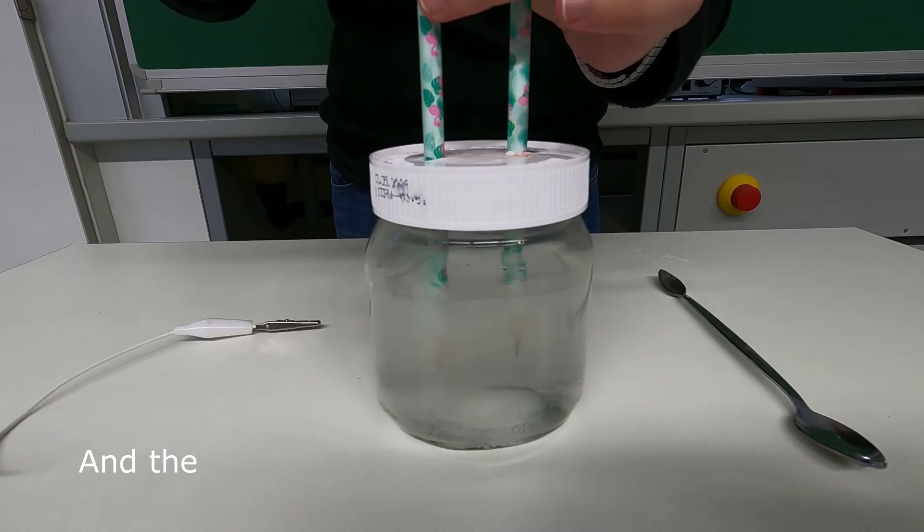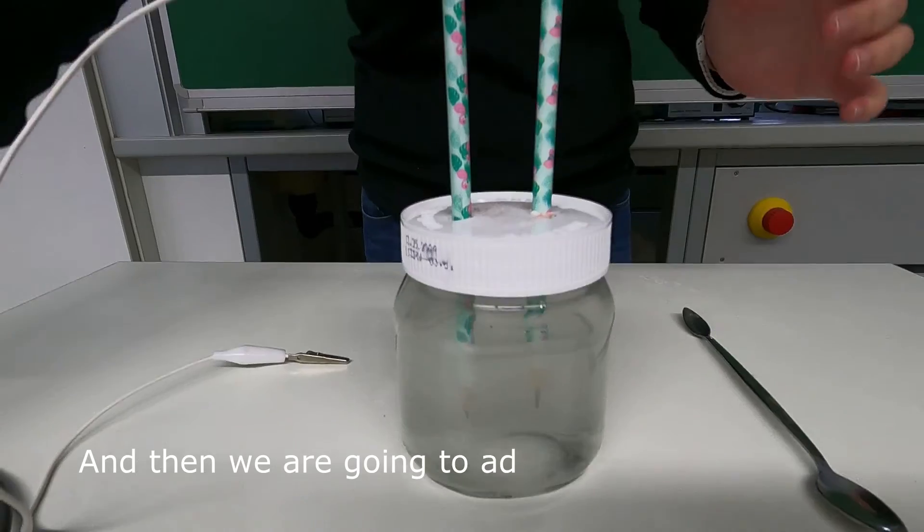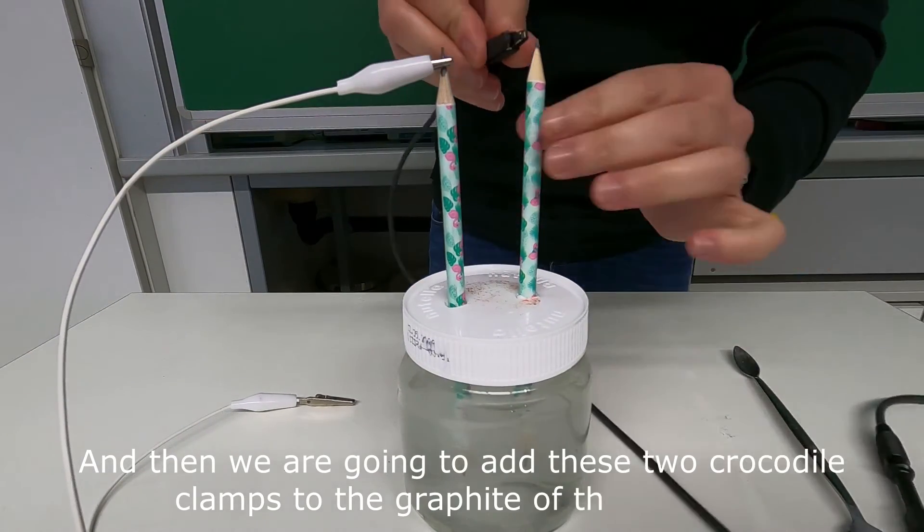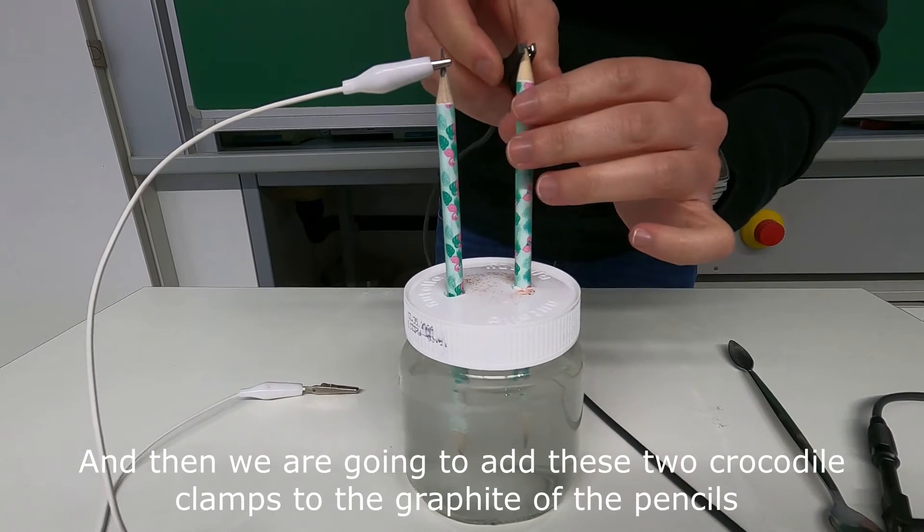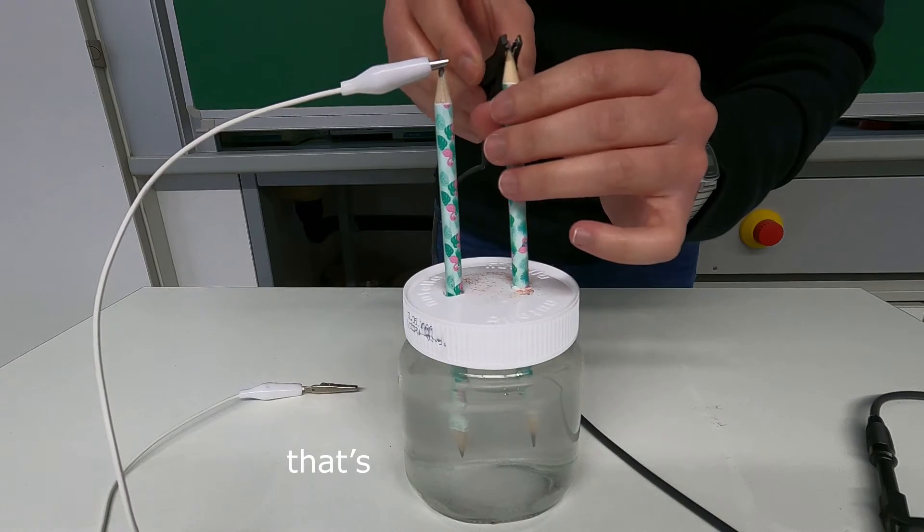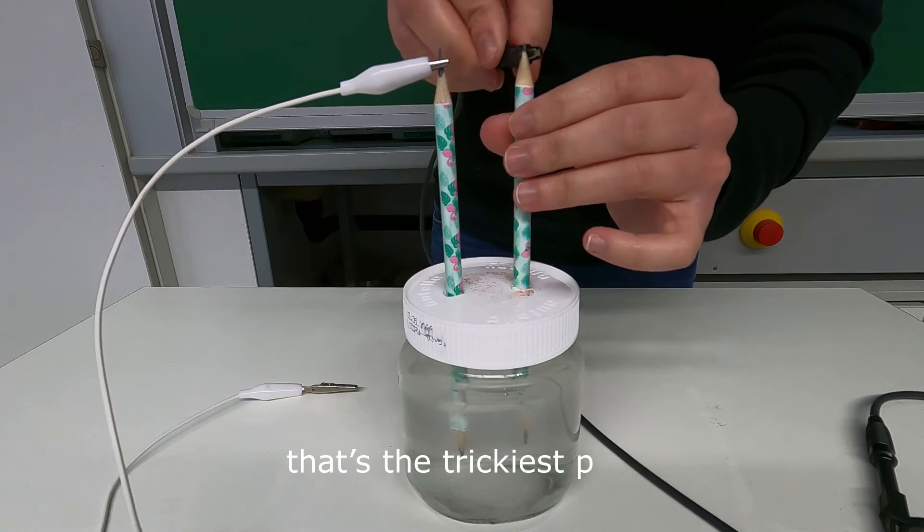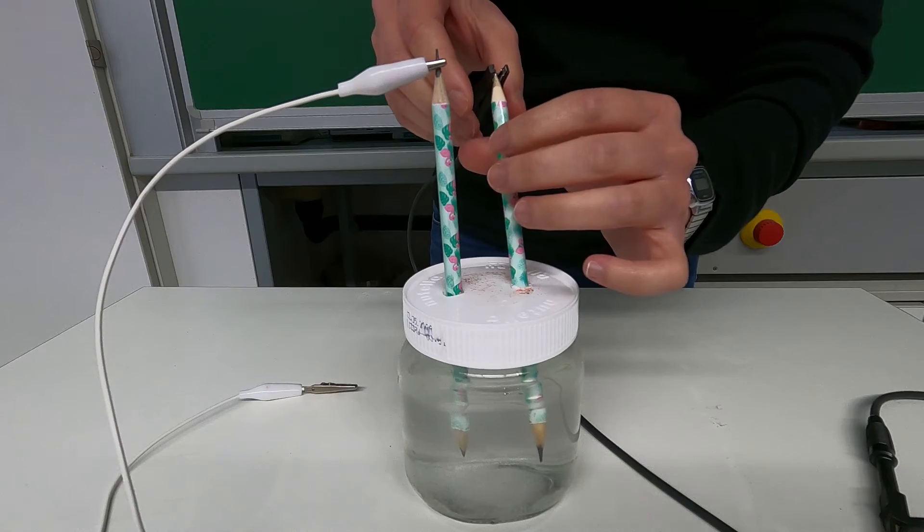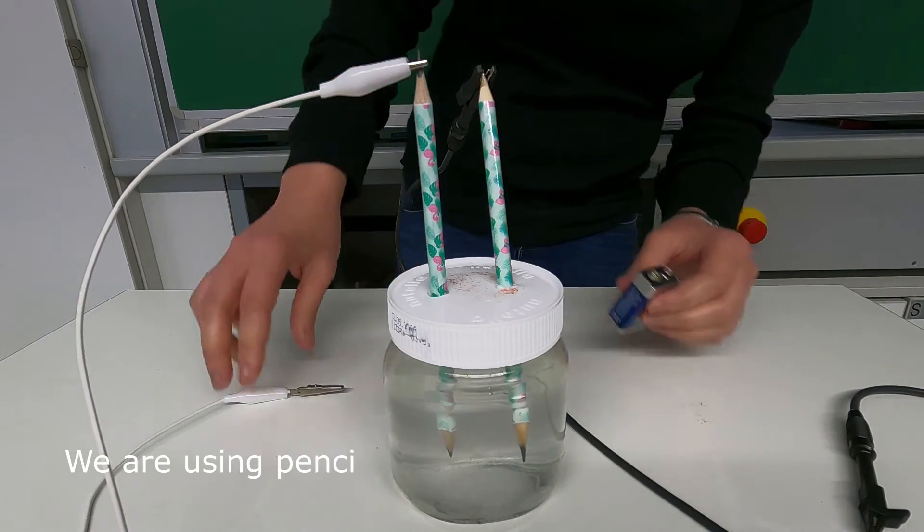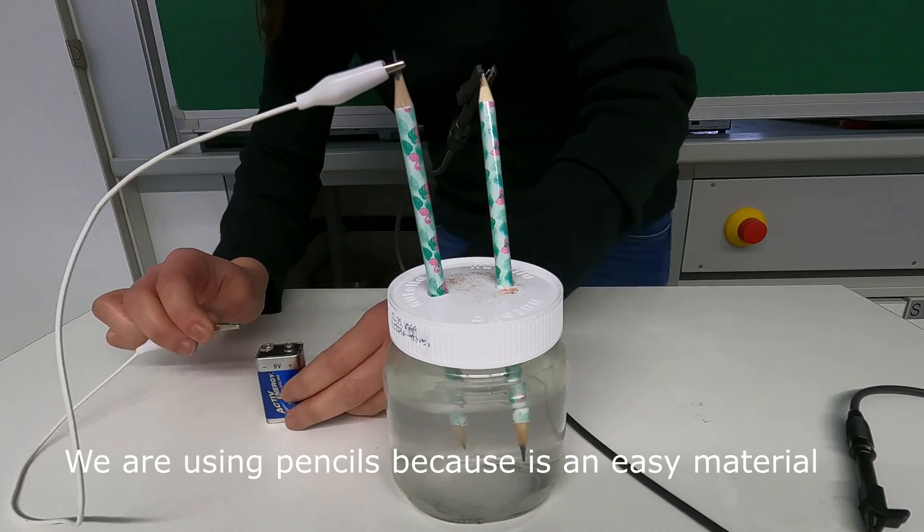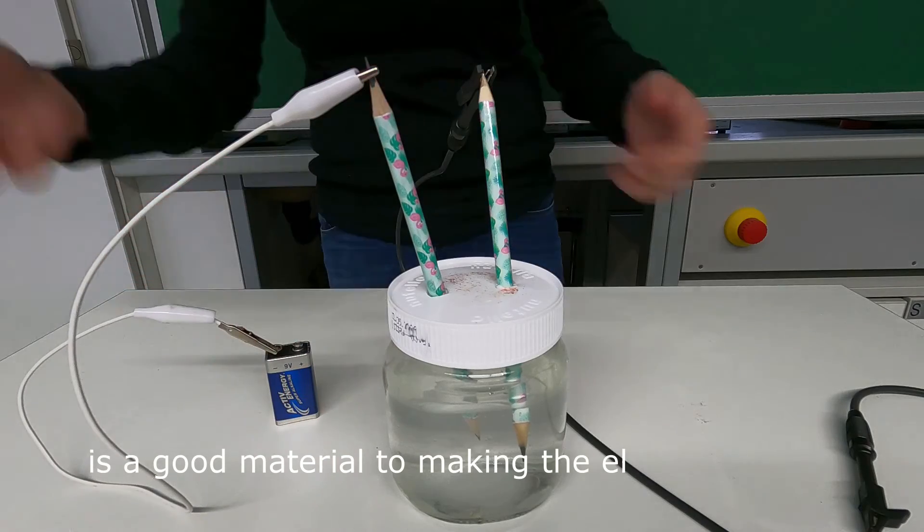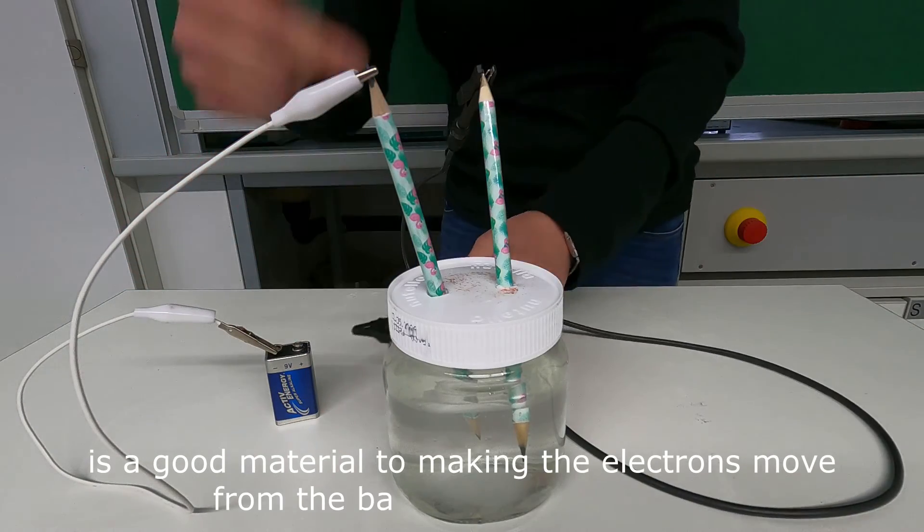And then we are going to add these two crocodile clamps to the graphite of the pencil. That's the trickiest part. We are using pencils because it is an easy material to find and moreover graphite is a good material for making the electrons move from the battery to the solution.